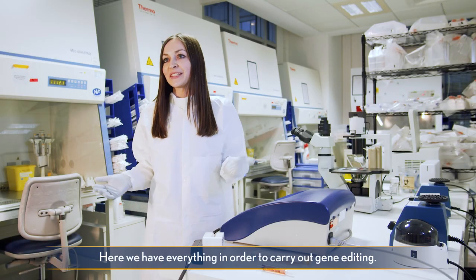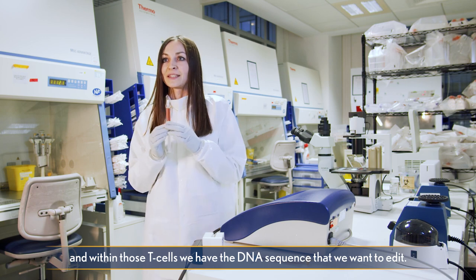Here, we have everything in order to carry out gene editing. Here, we have our one billion T-cells. And within those T-cells, we have the DNA sequence that we want to edit.